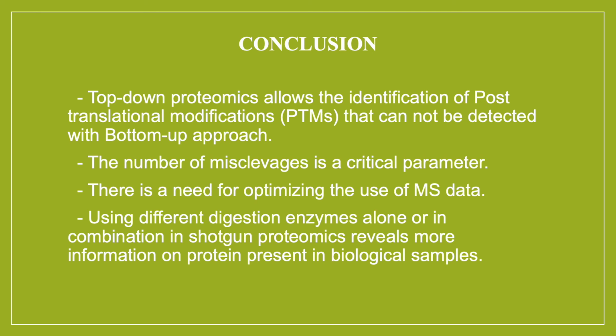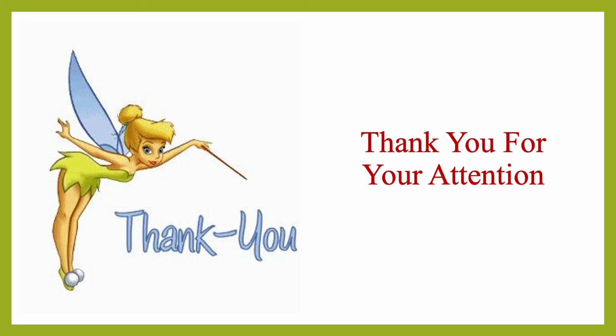The number of miscleavages is a critical parameter because it expands the extent of the search. The majority of MS data has not been exploited, so we need to come up with an optimized method for data usage. This research is a typical example. Lastly, using different digestion enzymes alone or in combination in shotgun proteomics reveals more information on proteins present in biological samples. This is the end of our presentation.